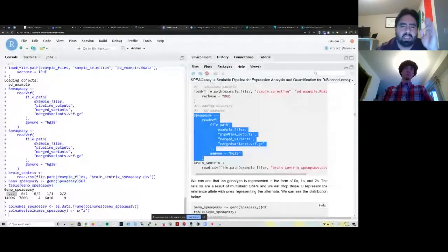If you take the variants for your 20 samples and you correlate them, you should be able to get small groups where you have 2 samples that are very highly correlated with each other in the variants, and those should correspond to your 10 donors, those 10 groups of 2.